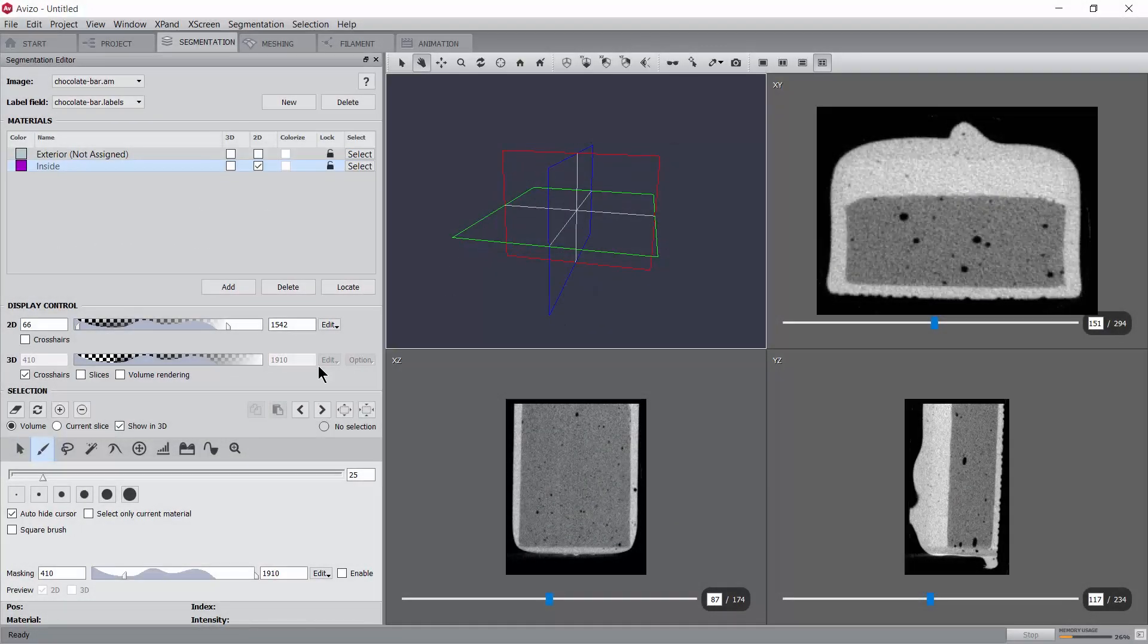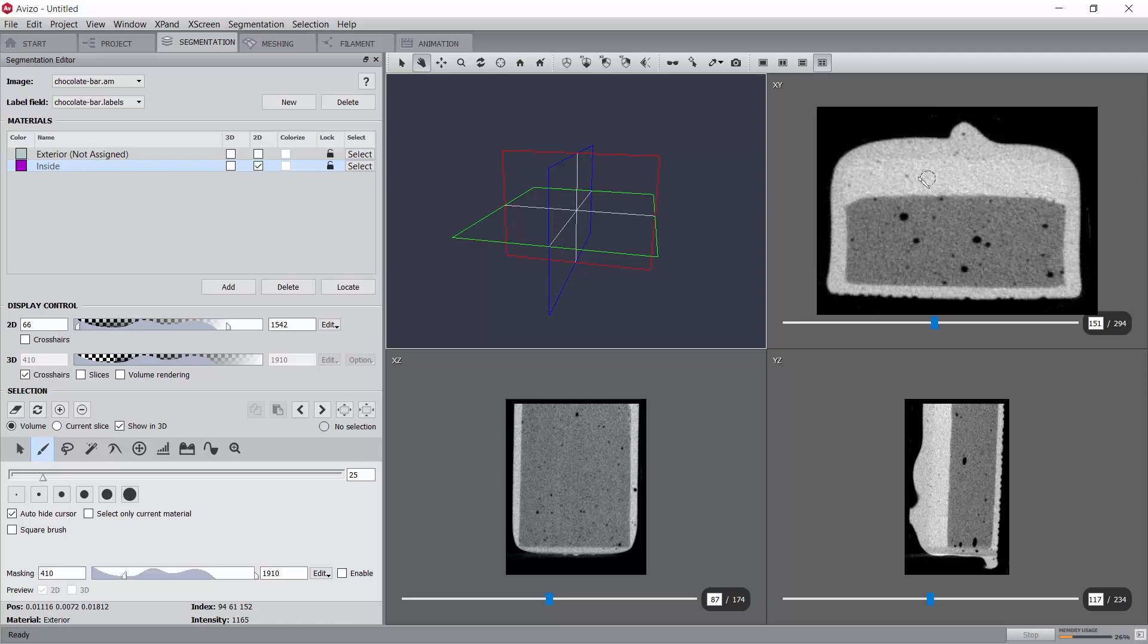This tutorial will present one approach to segment this chocolate bar into four phases: the bar itself composed of a chocolate coating, a layer of caramel and a mousse filling, as well as air bubbles.